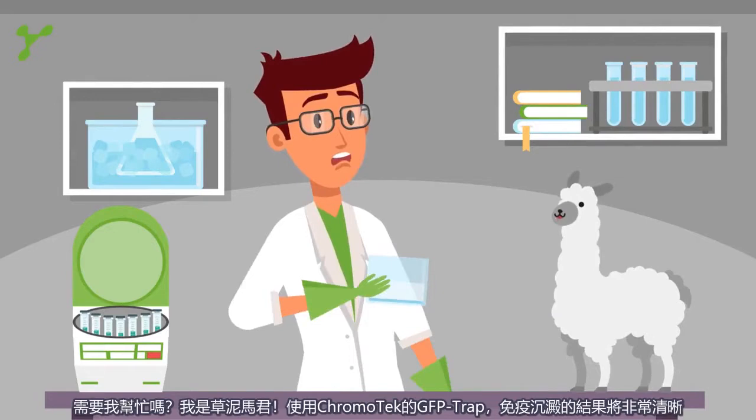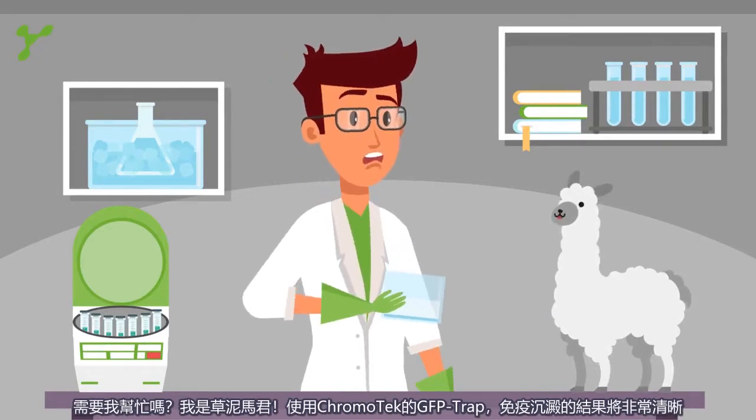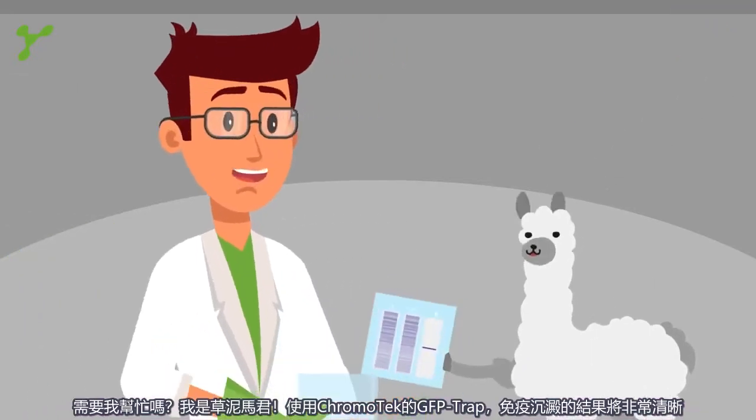I can help you! If you use Chromatek's GFP trap, the IP would look like this.